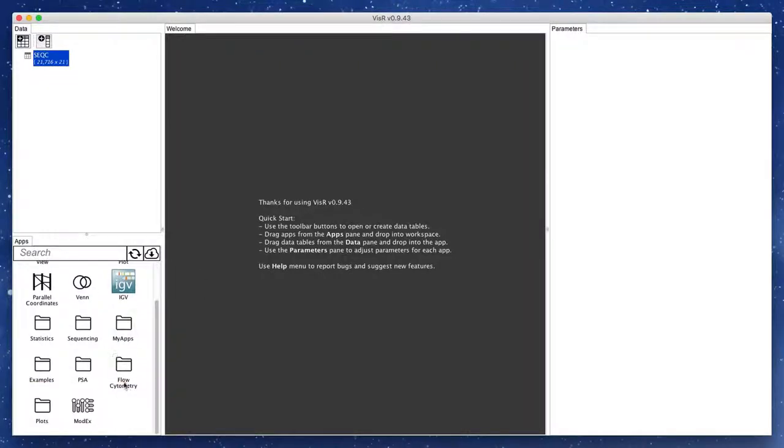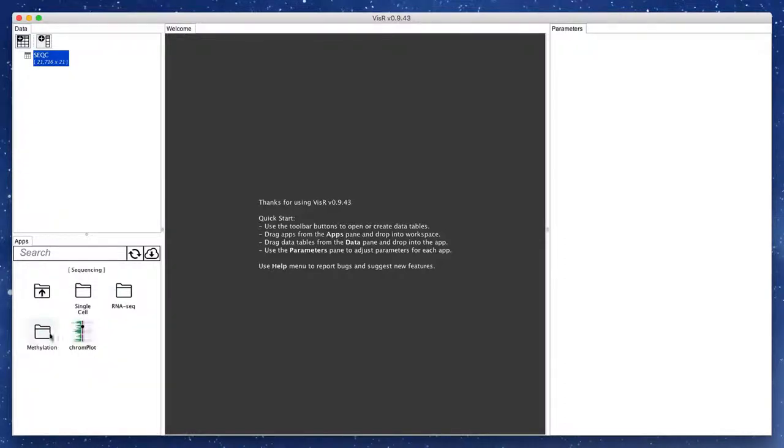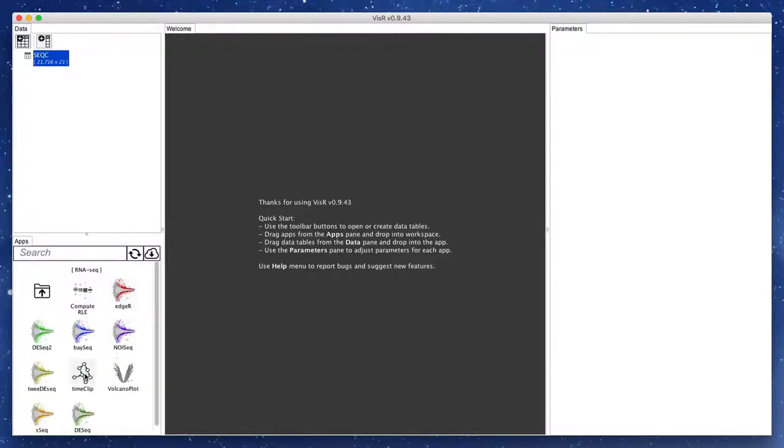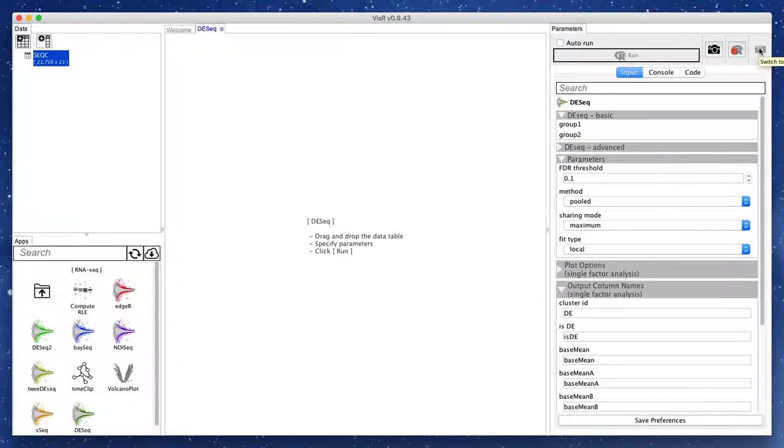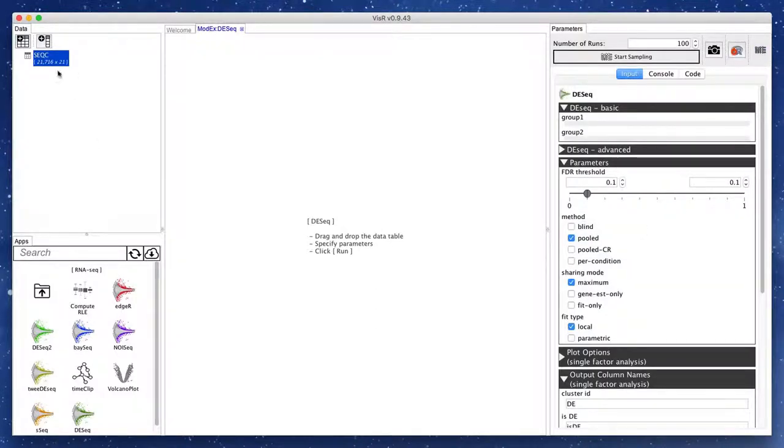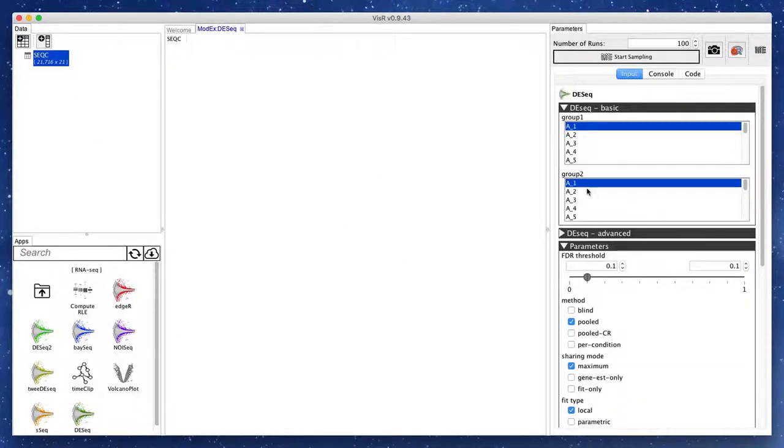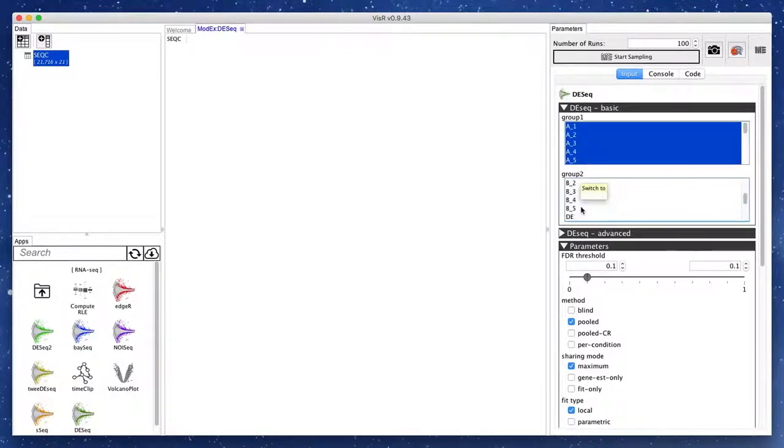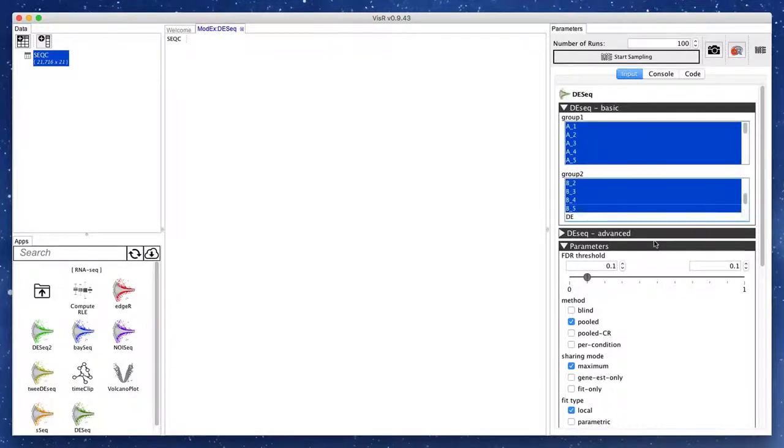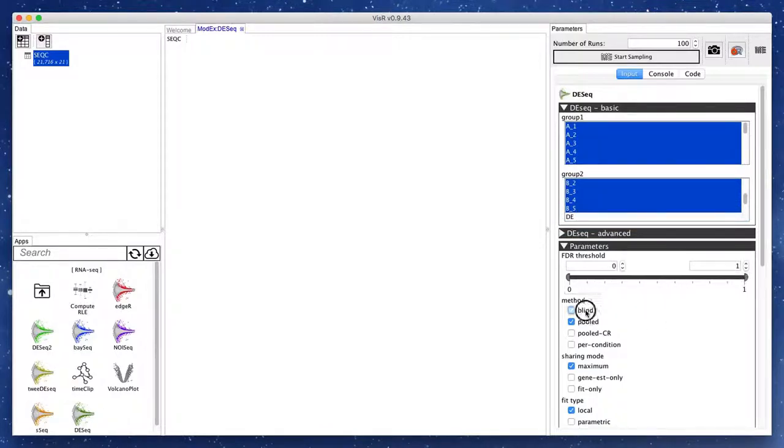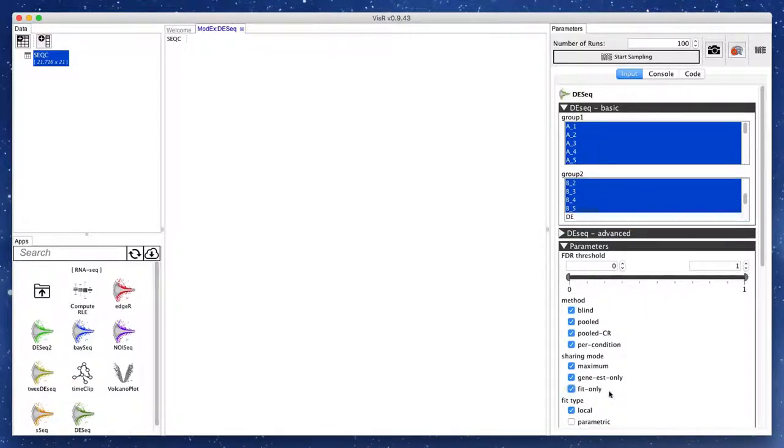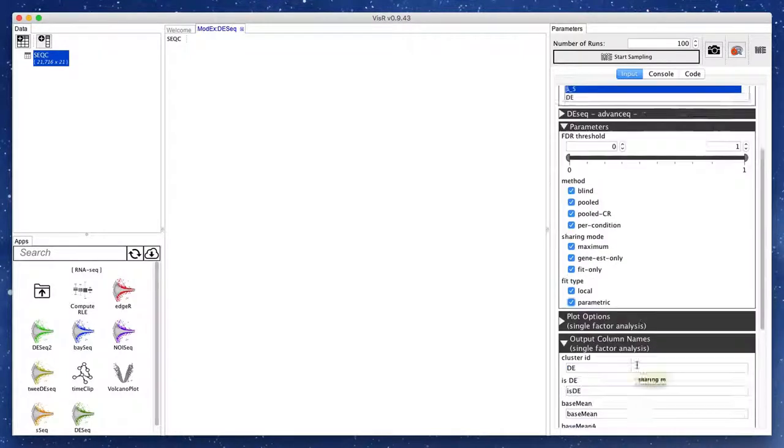Similar to the standard analysis, we need to add the DESeq app to our workspace and assign the input data. This time, we click on the ModX toolbar button to switch the app's parameter view to the ModX mode. In this mode, rather than single values for each parameter, we can specify ranges of values. ModX will use the specified ranges to create random combinations to run the app with.